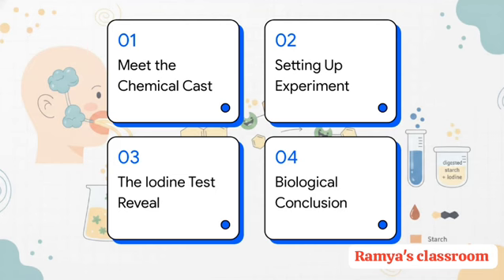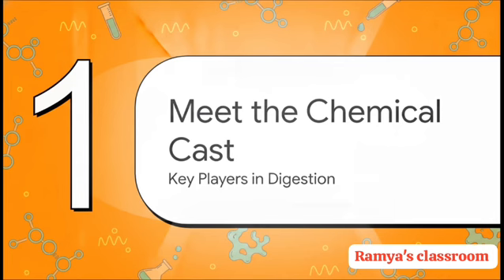So here's our quick roadmap for today's experiment. First up, we'll meet the chemical cast, then setting up the experiment. After that, we get to the iodine test reveal, and finally, we wrap it all up with the grand biological conclusion. Okay, let's dive into this. Section 1. Meet the chemical cast.